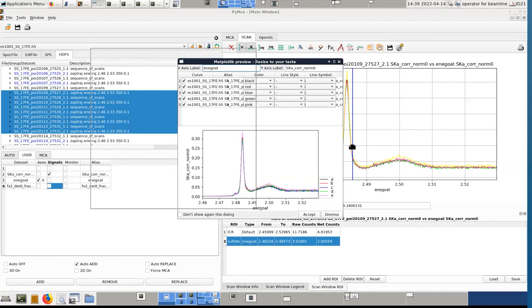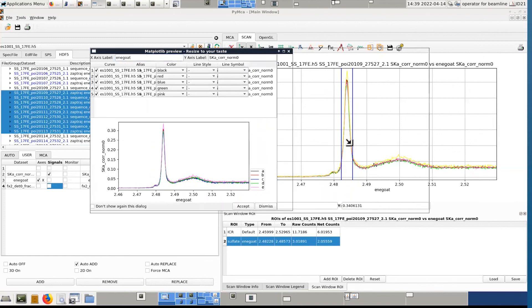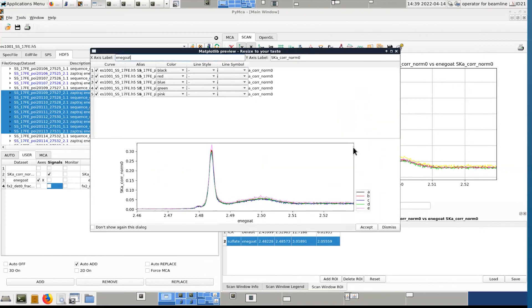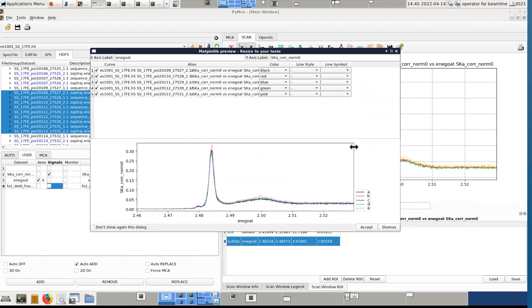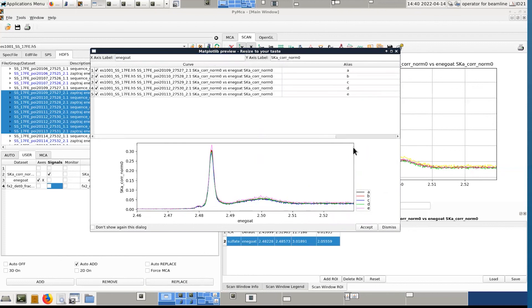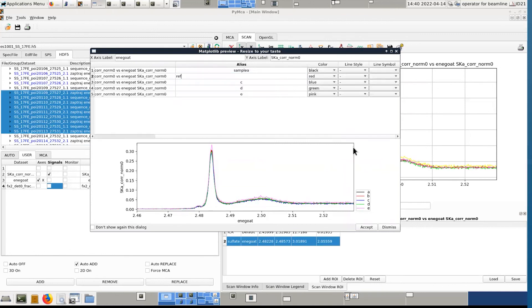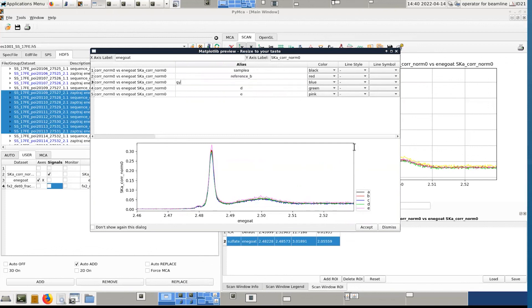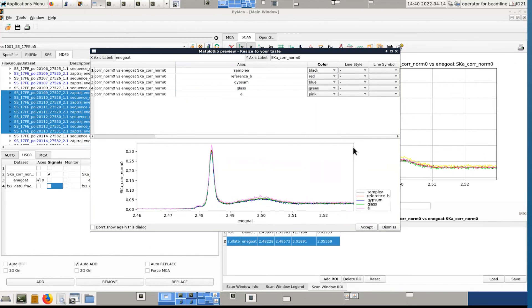So you have the possibility to change the name of the scans. So by default, it's A, B, C, D, E. That's because the name of your scans is very long. So we could say, I don't know, some party. Reference. It's from the file. I've selected. Deep zone. It's from the file. B. Deep zone. It's from the file. Whatever. And then this will be updated. As soon as you click on one of these refresh options. So now you see that I have the names of these scans.